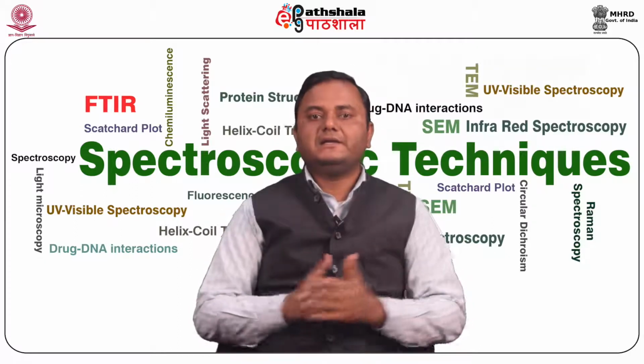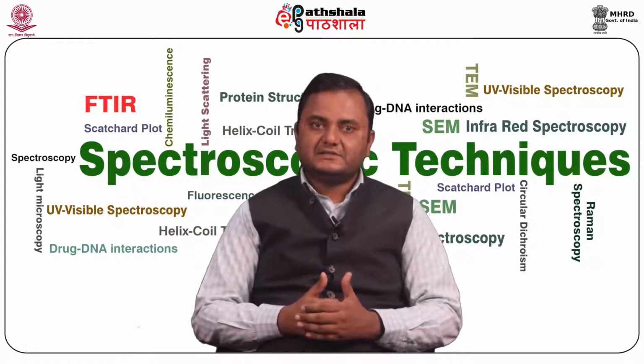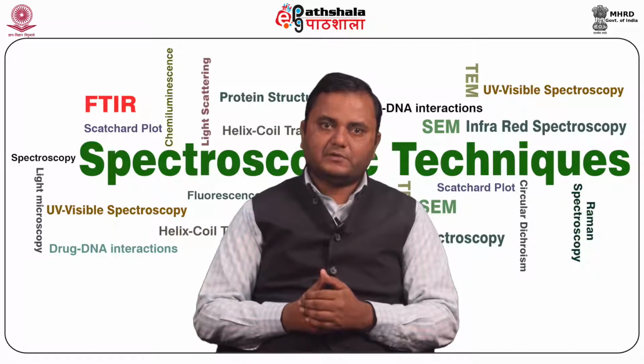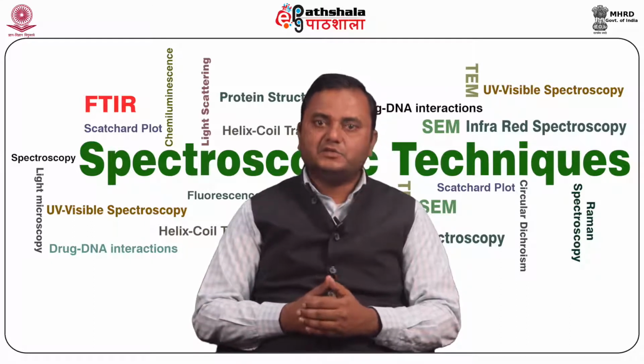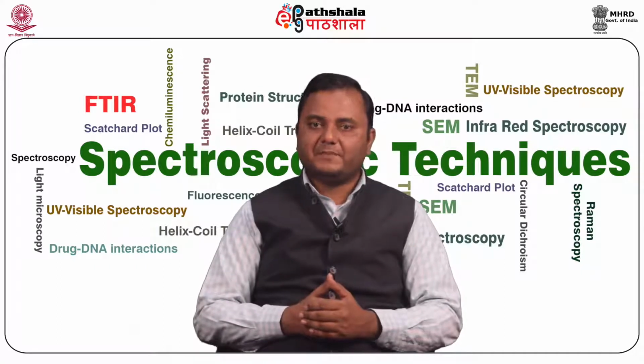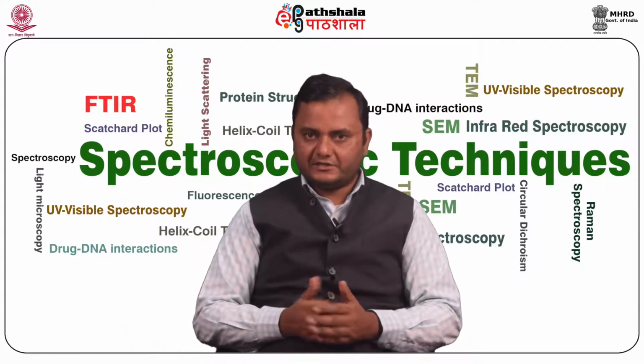There are some thermal detectors that are not used in FTIR. The response time of thermal detectors, for example thermocouple and thermistor used in dispersive IR instruments, is too slow for the rapid scan time of the interferometer, which is 1 second or less.